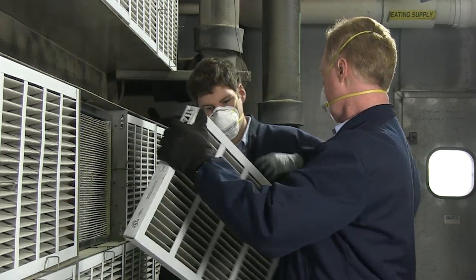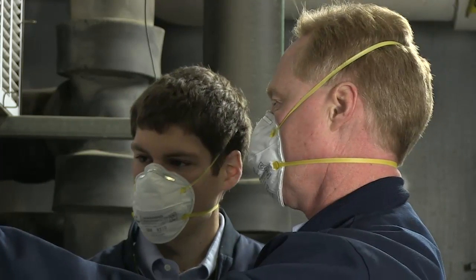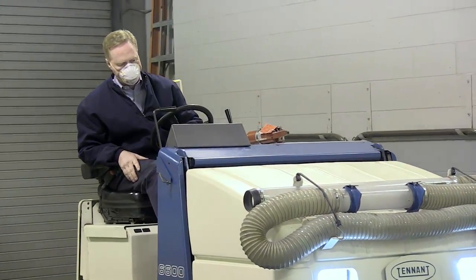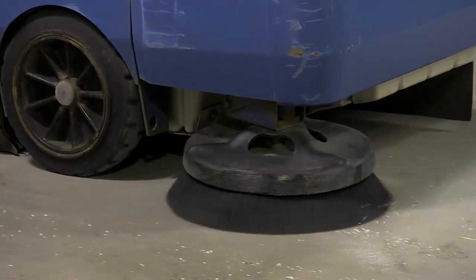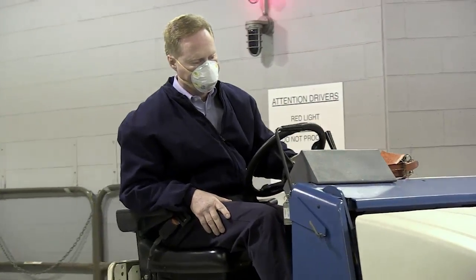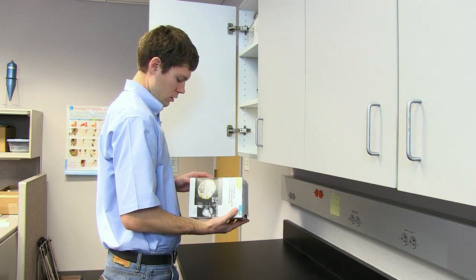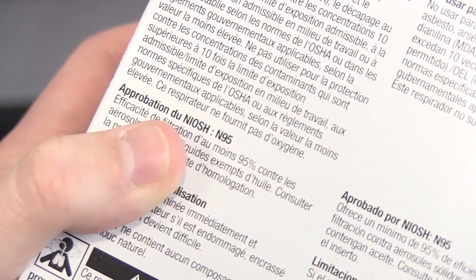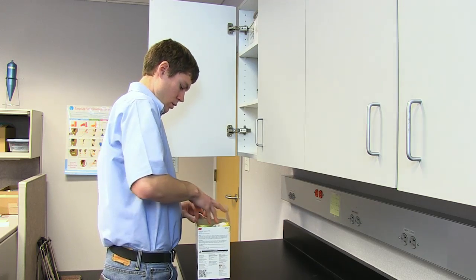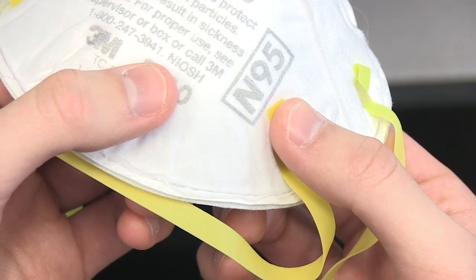If you wear a respirator on the job, it's important to know how to safely put it on and dispose of it when you're finished with your work. N95 respirators block at least 95% of hazardous dust and other very small particles that employees may be exposed to during their work. Check the respirator manufacturer's package, or the respirator itself, to make sure N95 and NIOSH are printed on the front. If you don't find these listed, the respirator may not provide the level of protection you need.